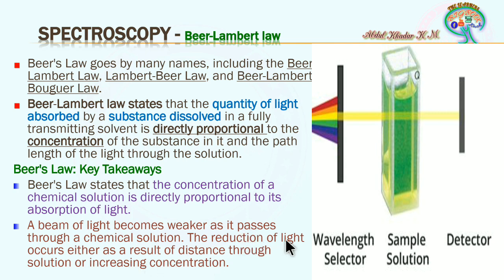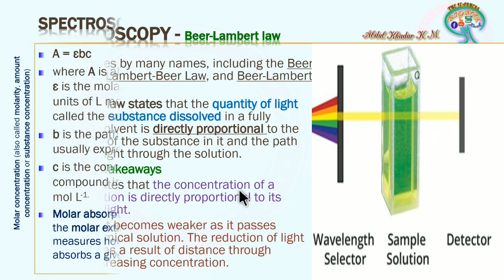If there is a decrease in the light, there should be an increase in the concentration. In the sense, whatever concentration is present in this solution is going to reduce the light which passes through it. That is what it means.